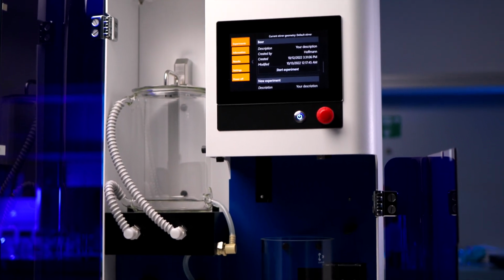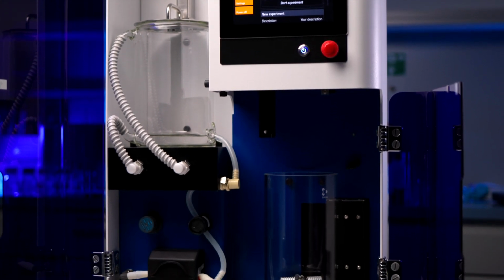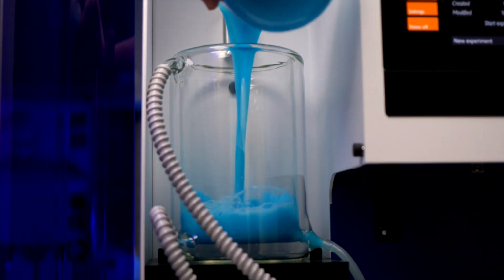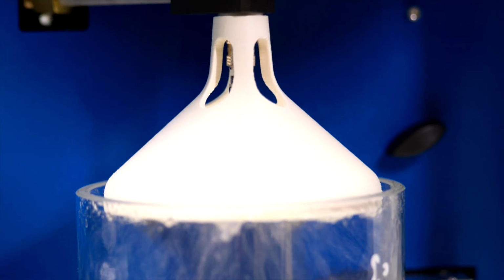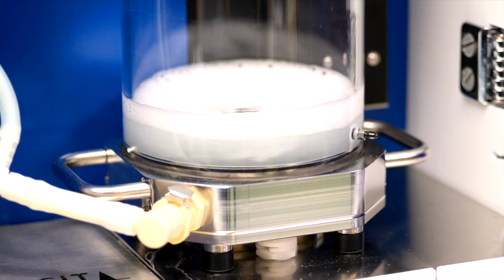Are you faced with the challenge of understanding the complexity of foaming? The SITA FoamTester is a fully automated system for the reproducible analysis of the foaming behavior of liquids. The instrument prepares and analyzes the sample, as well as cleans the measuring vessel. Test sequences are performed and repeated automatically.